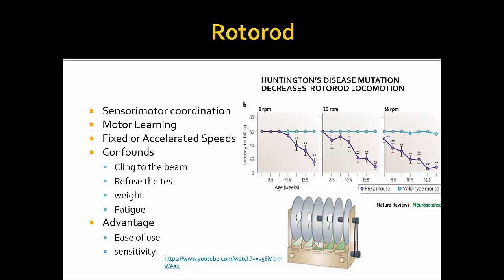So you have to learn your species of animal and strain, and whether it's willing to do that test that you keep putting it on, or whether it's going to think, no, I know that if I fall off, you're going to tell me I can stop. So here you can watch this pretty cool video.